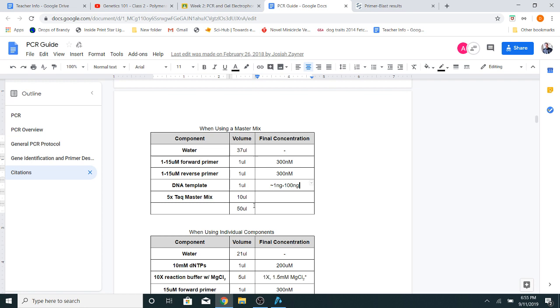There are a lot of different versions. Usually a pretty standard reaction just runs through the cycles we talked about earlier, but there are also advanced things like touchdown PCR, which slowly works towards the annealing temperature if you're having specific kinds of trouble. You can also do hot start and other variations. Get the core PCR reaction down, because you'll use it a lot, and you'll use many modified versions of it to do assembly, sub-cloning, and manufacturing, all in PCR. You can do a lot of things in molecular biology with PCR.